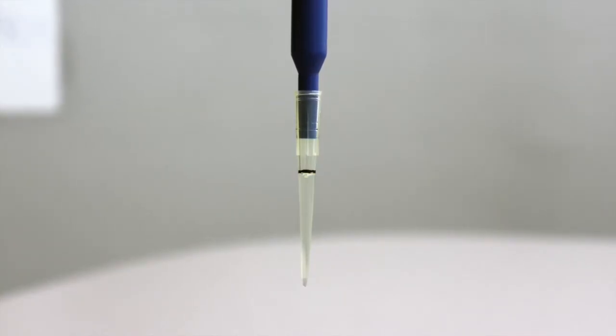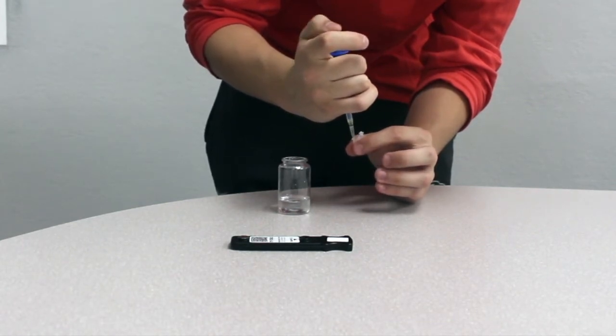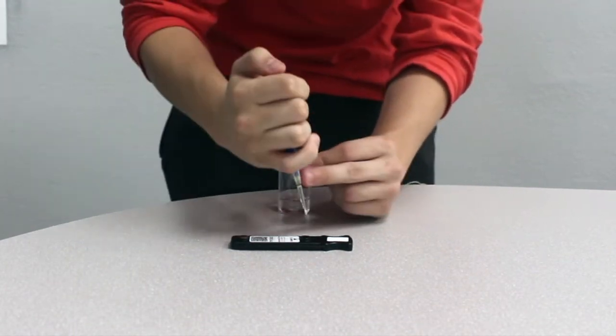To ensure 100 microliters has been drawn, make sure the sample fills the pipette tip to the line marked. Using the pipetter, aspirate and dispense at least 5 times to ensure that the reagent and sample material are properly combined. Ensure that the entire pellet has been rehydrated after mixing.